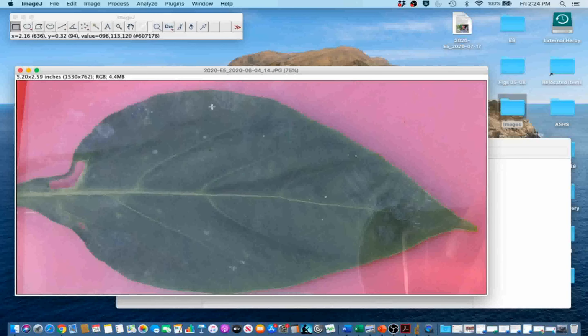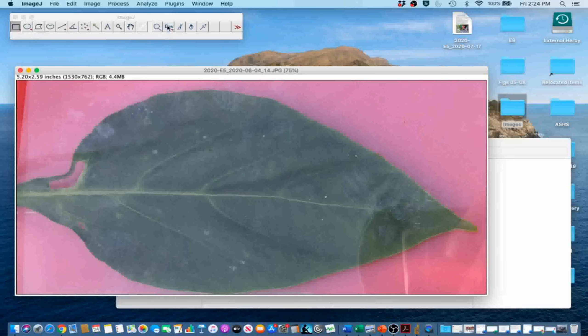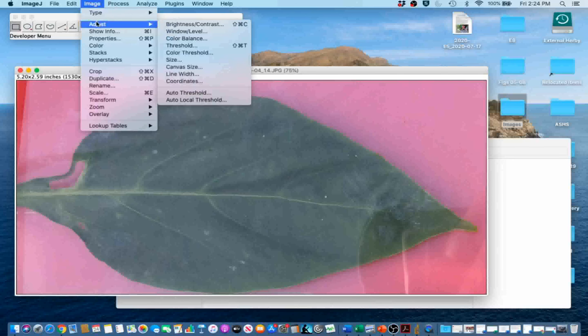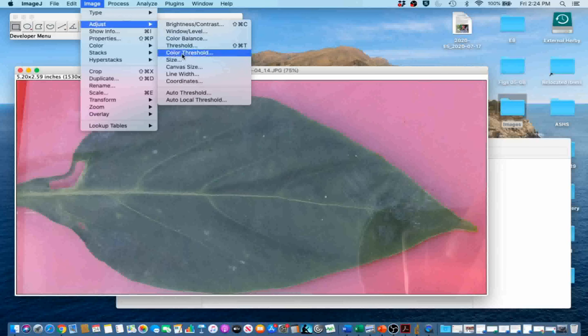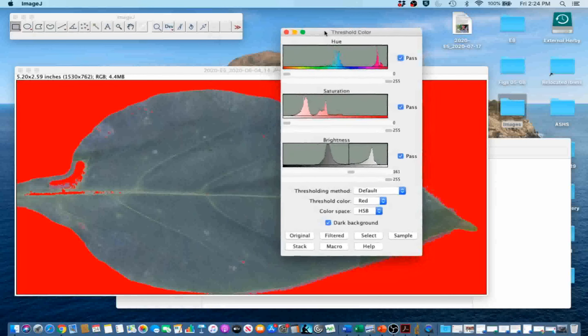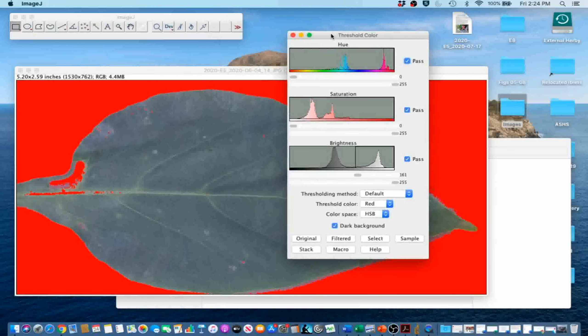Now that our image is scaled and cropped, we are going to go to Image, Adjust, Color Threshold to separate the leaf from the background. We are going to adjust the hue, saturation, and brightness to select the leaf.